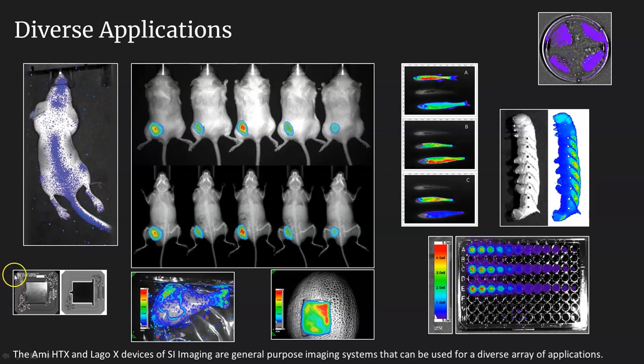Now, finally, what we're looking at down here is simply the use of our sister imaging modality, the X-ray, for the purposes of evaluating the details of the structure of certain materials of interest to investigators. So this is an application that some of our investigators use when they make use of our imaging systems.